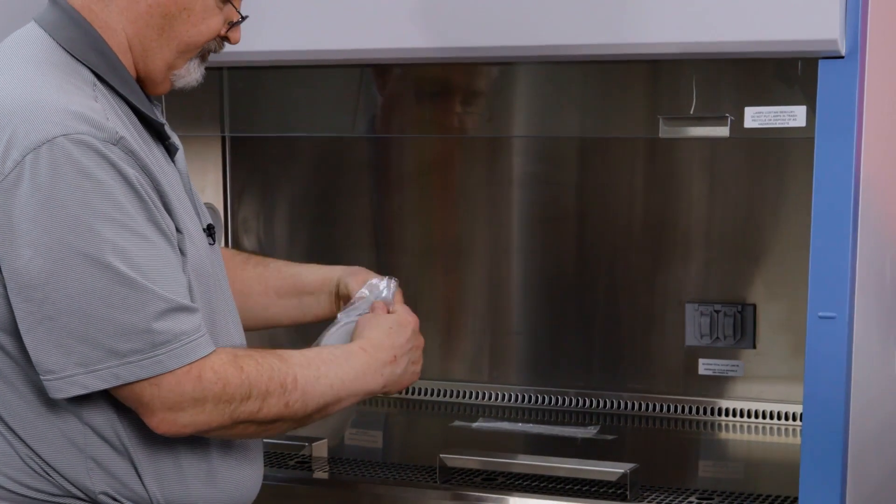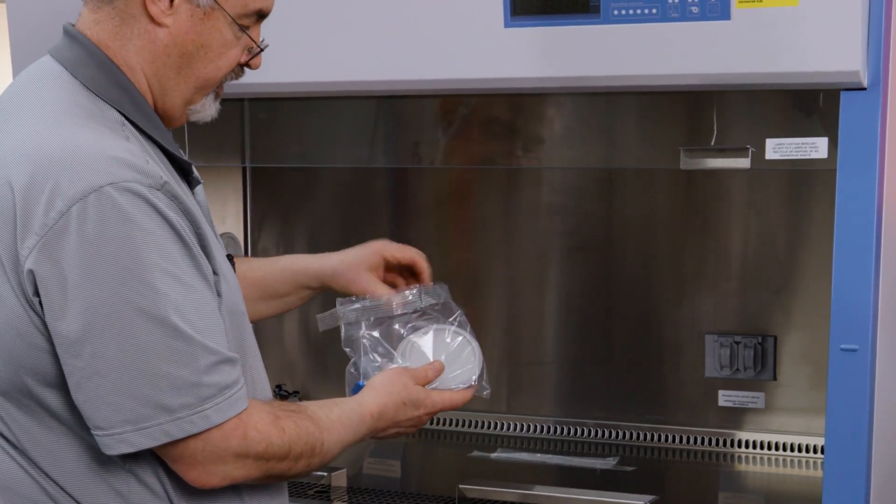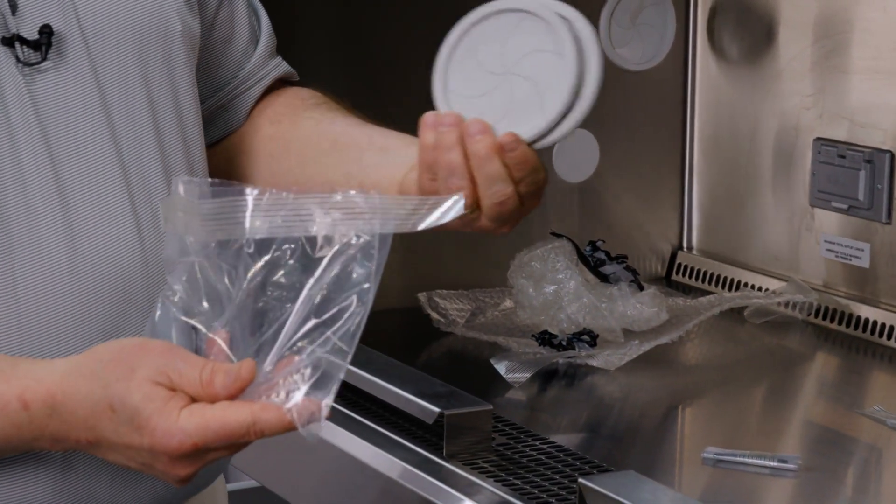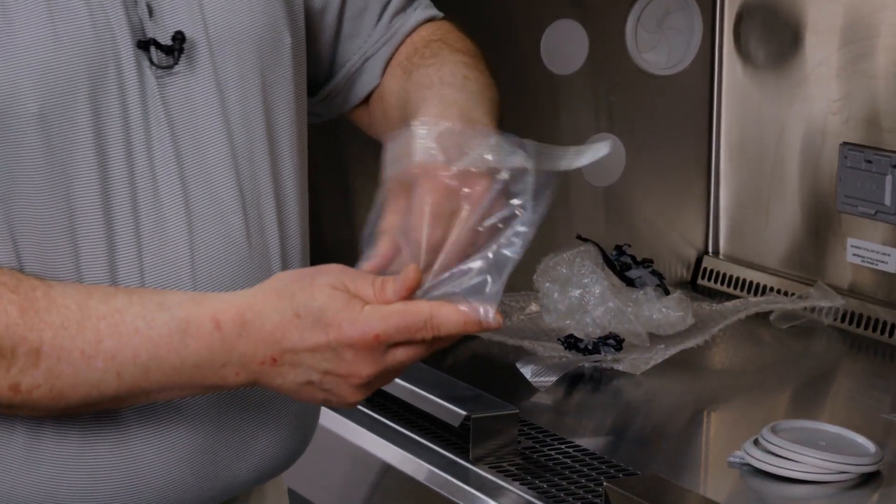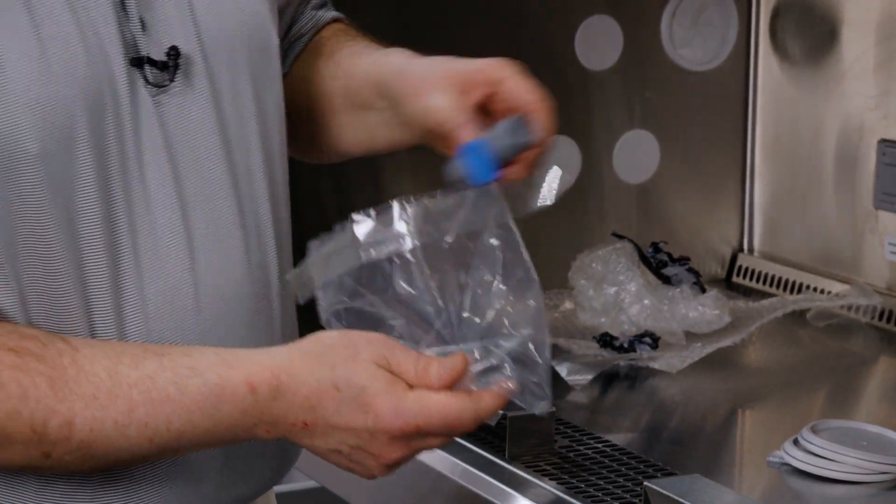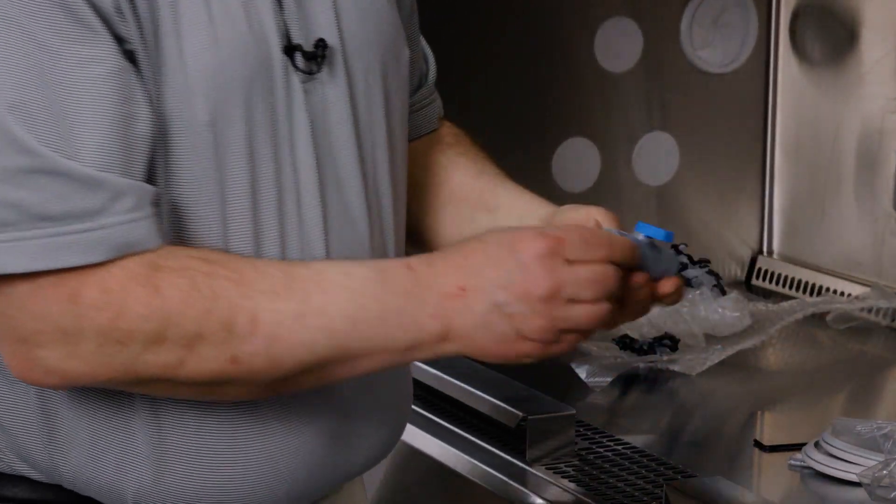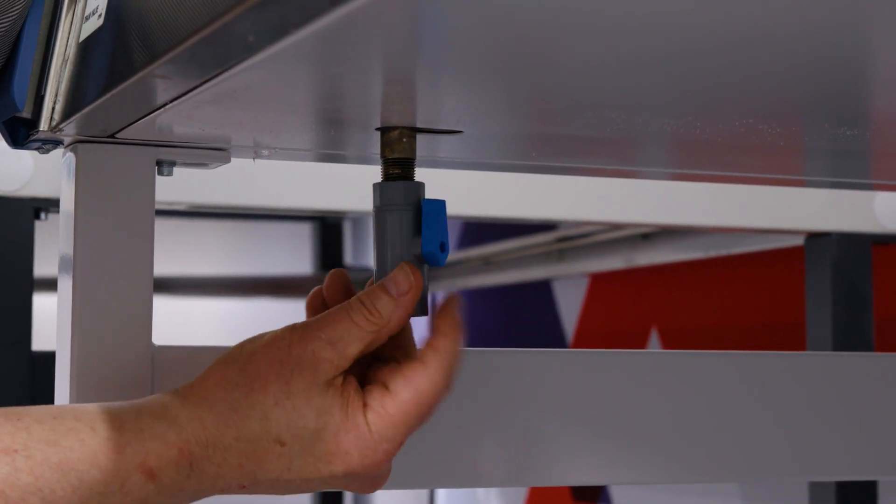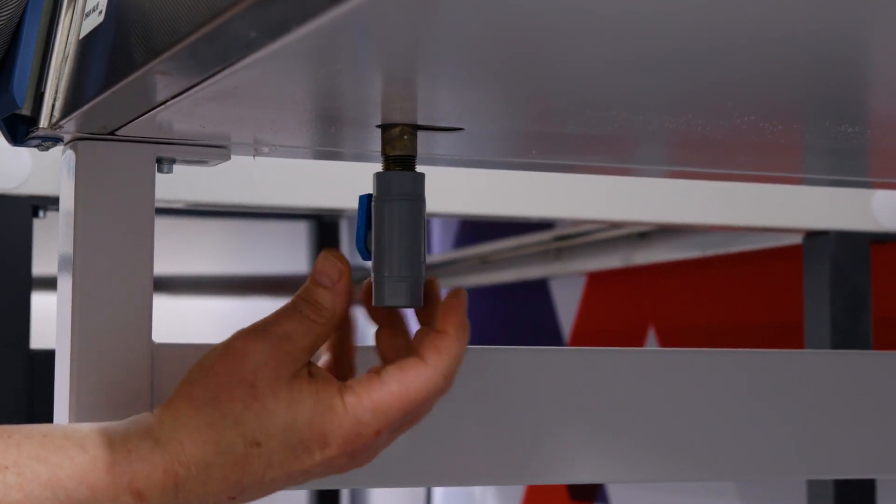In the front work surface you'll find this little package. It contains an extra allen wrench, some spare grommets for your smart port, and the drain valve. And we just thread it onto the exposed pipe, the drain pipe, on the underneath of the cabinet.